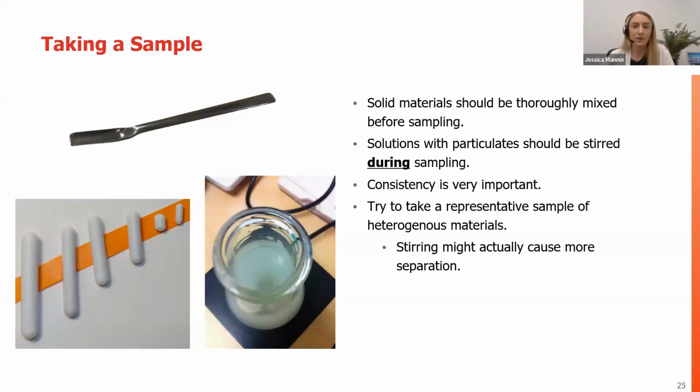That solid material should be thoroughly mixed before sampling. Again, going back to that homogeneity, making sure we have a very representative sample. Of course, this will help with accuracy, but it's even more important for precision to make sure that each sample is equally represented.